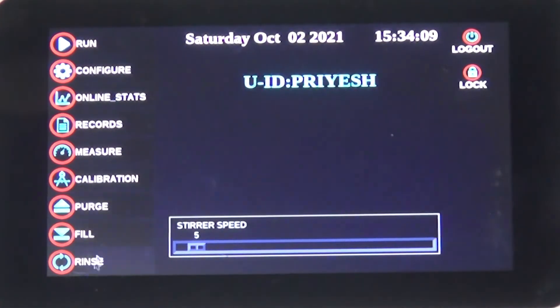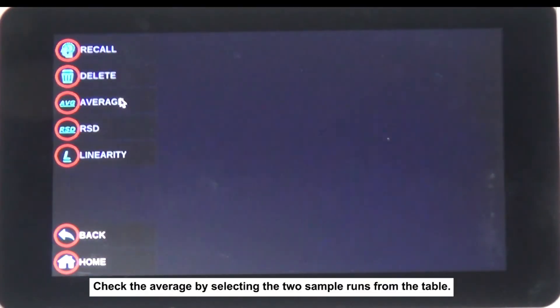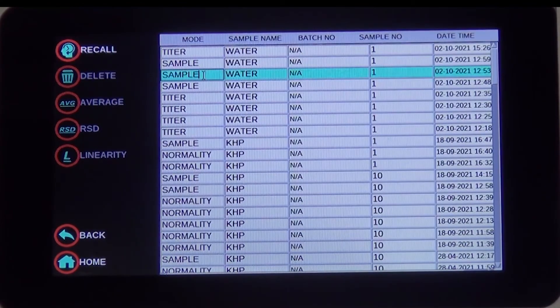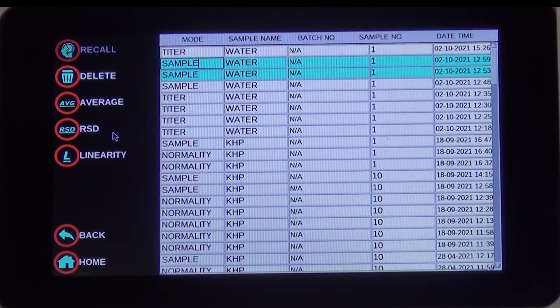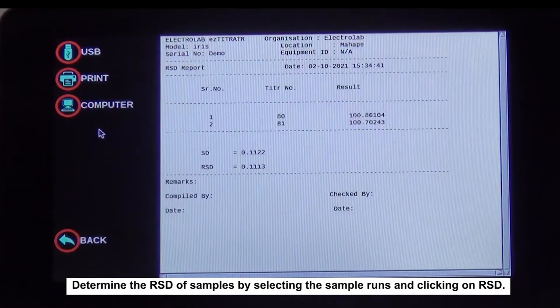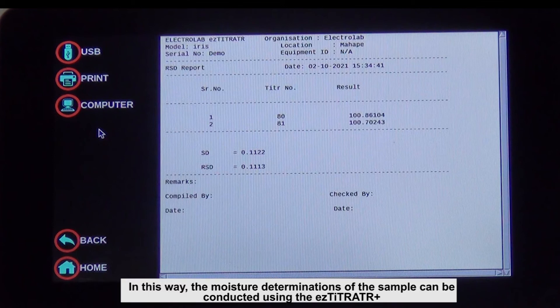To view the results, go to Records from the home screen and click on Titration. Check the average by selecting the two sample runs from the table. Similarly, determine the RSD of samples by selecting the sample runs and clicking on RSD. The RSD can be viewed in the report; an RSD of less than 2% indicates minimum variation in the test sample results. In this way, moisture determinations of the sample can be conducted using the Easy Titrator Plus.